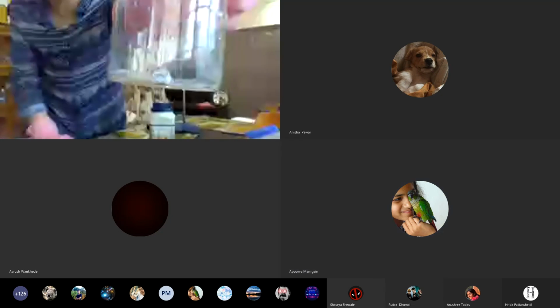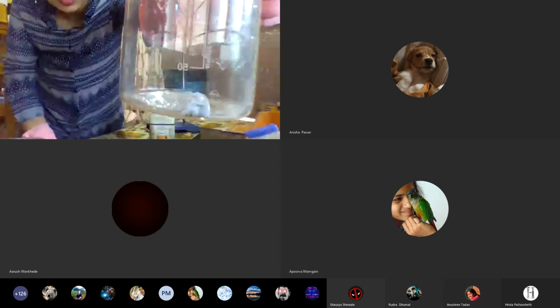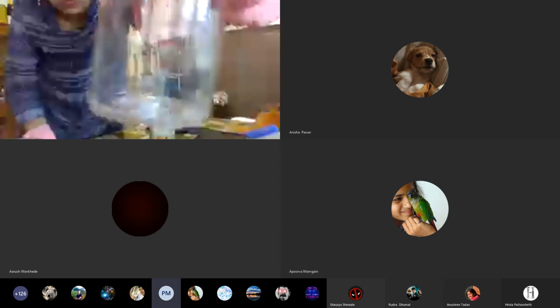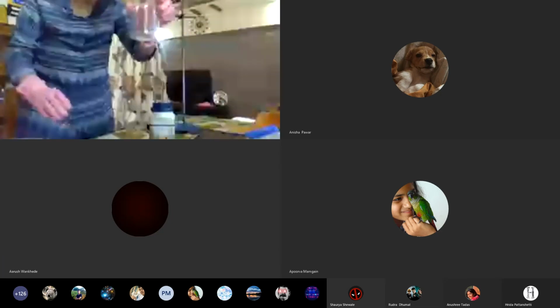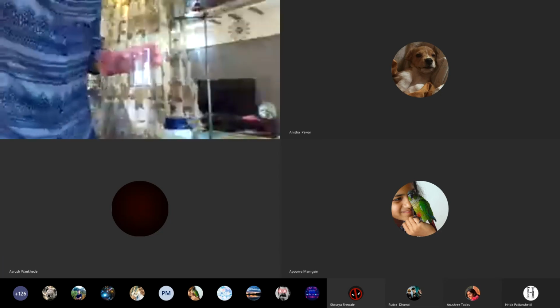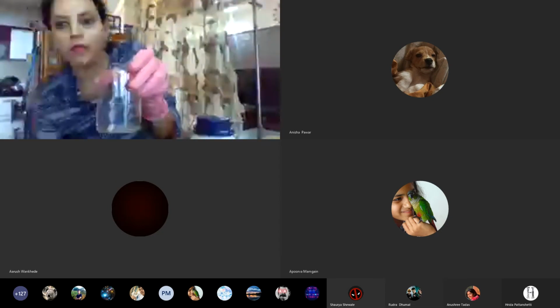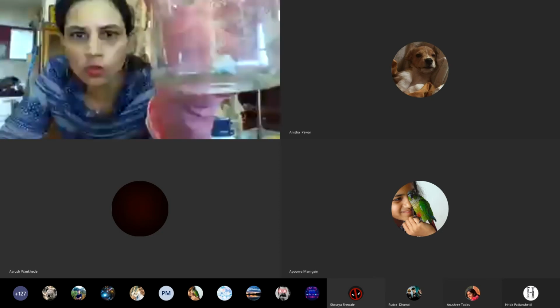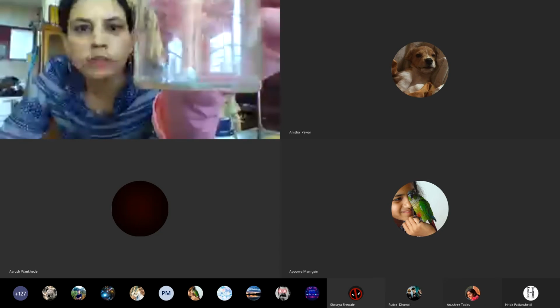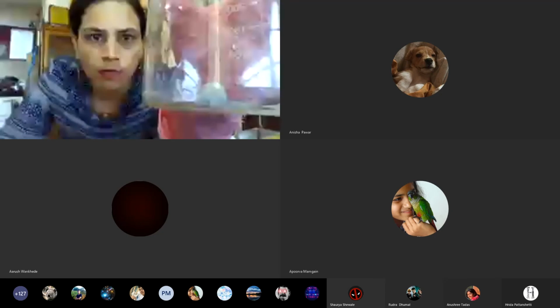So the sodium is reacting violently with the oxygen. So now what is the reaction? What is forming? Here, let me adjust. Let me sit here. So sodium is forming sodium oxide. So please note down the reaction. Sodium is reacting with oxygen and forming sodium oxide.